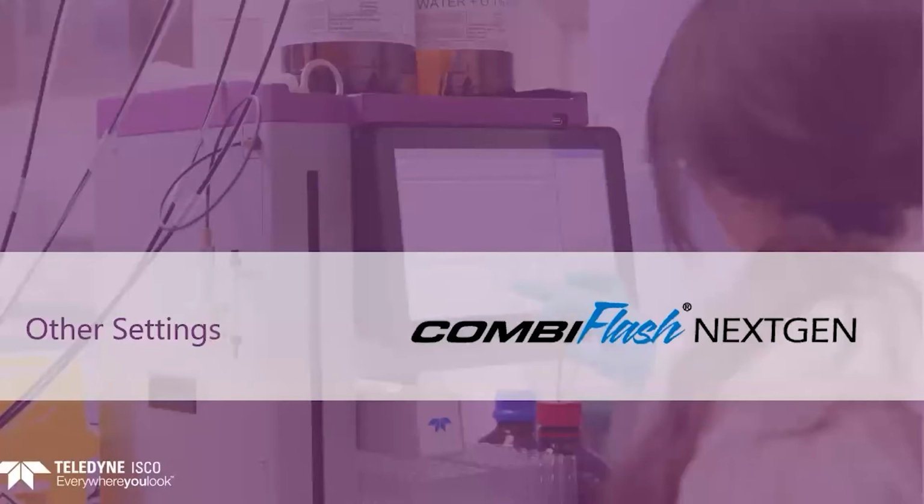At this point, we will describe some of the other controls and their functions.